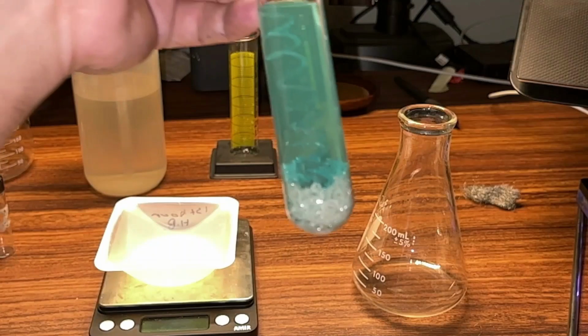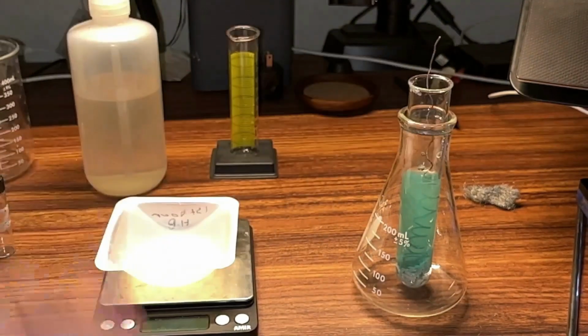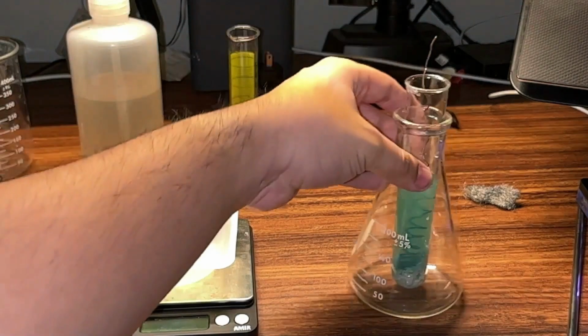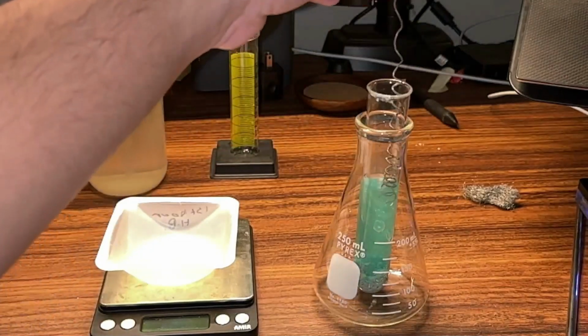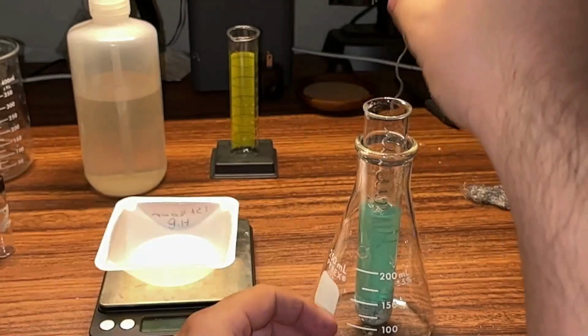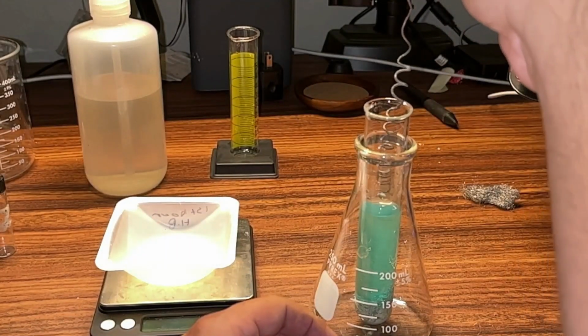I don't know if we could have done more or how good of a job we really did, but we'll figure that out in a sec. Let's see, we got to continue with our procedure here at step 10. So we're going to shake the silver crystals off of the wire the best that I can, trying to get everything off into the test tube.